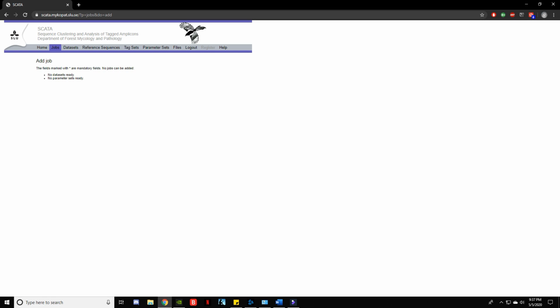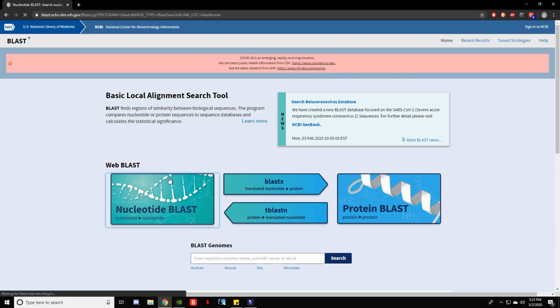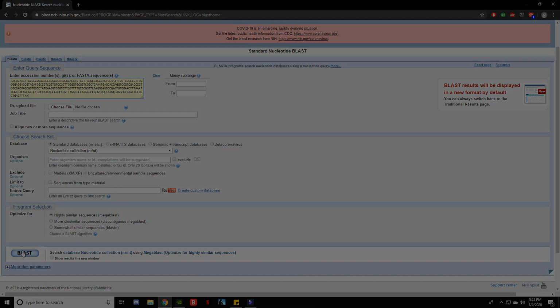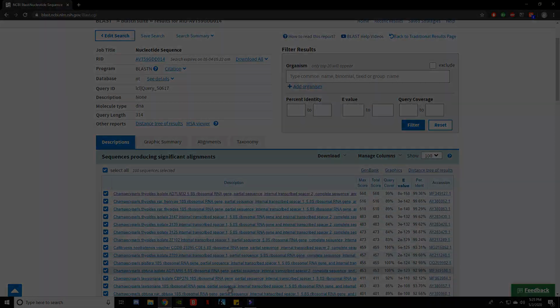The submissions will contain some species that are unable to be identified due to certain sequences not meeting our set parameters, at which case we then input the unidentified sequences manually through BLAST. That has summarized our whole bioinformatic portion of the presentation.